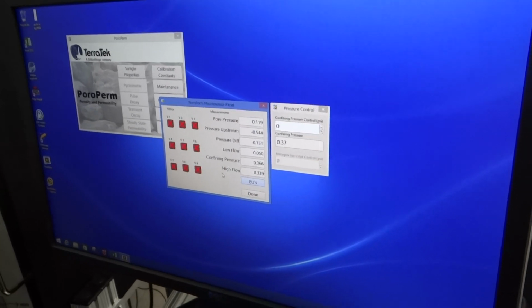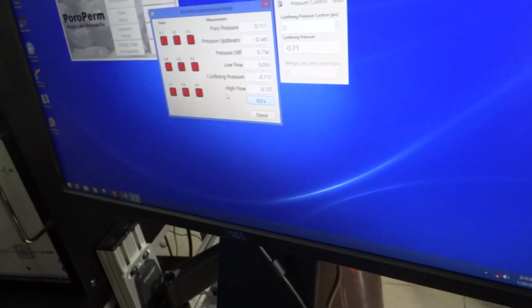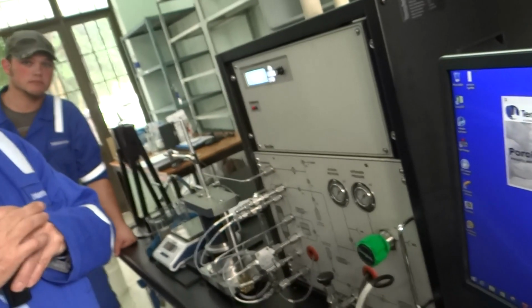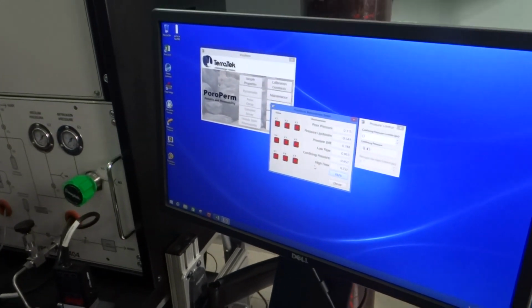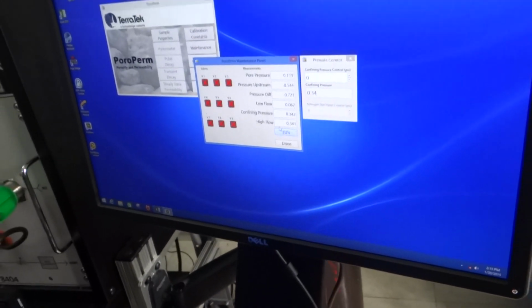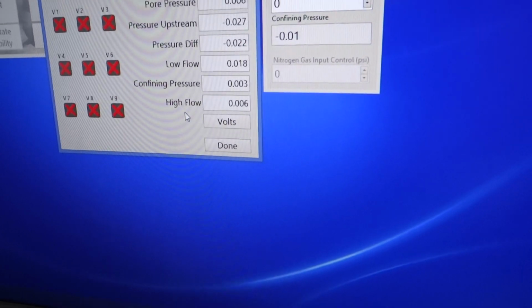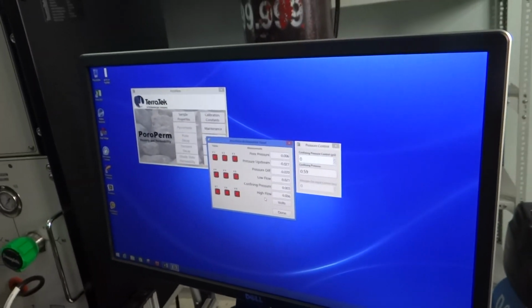There's a fan that equalizes the temperature of the gas before it goes into the system, and you just plug it in for right now. We'll come back to this one with the calibration. If you want to go ahead and close valves, you can, if you want to try.